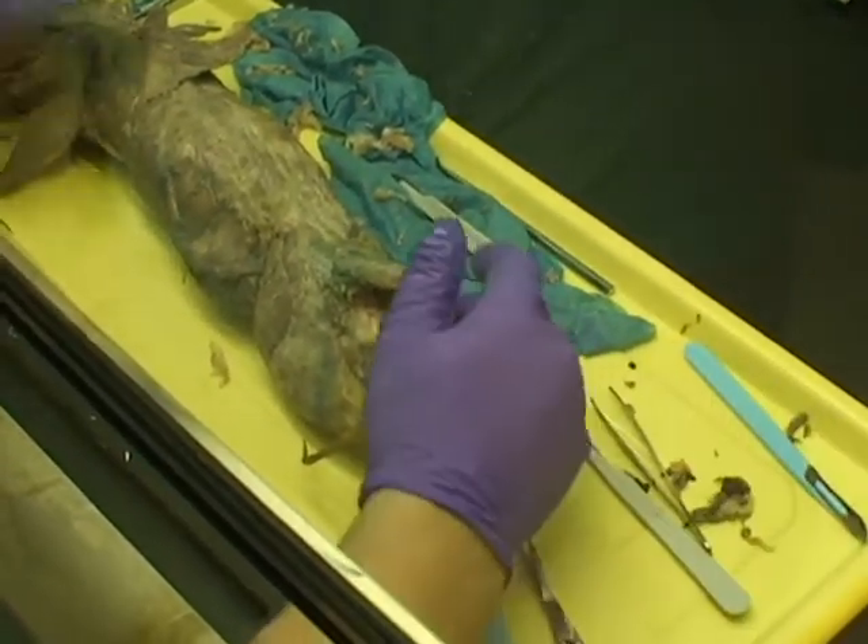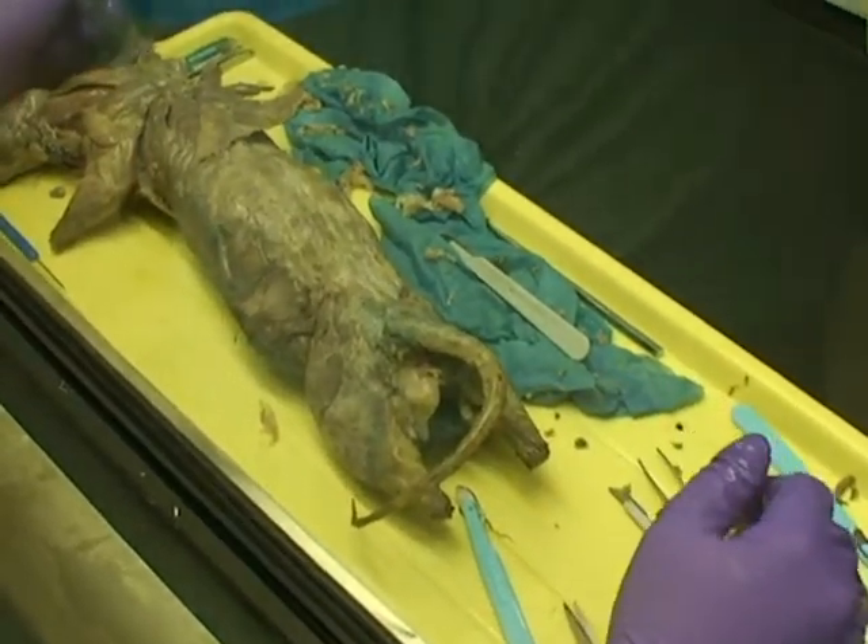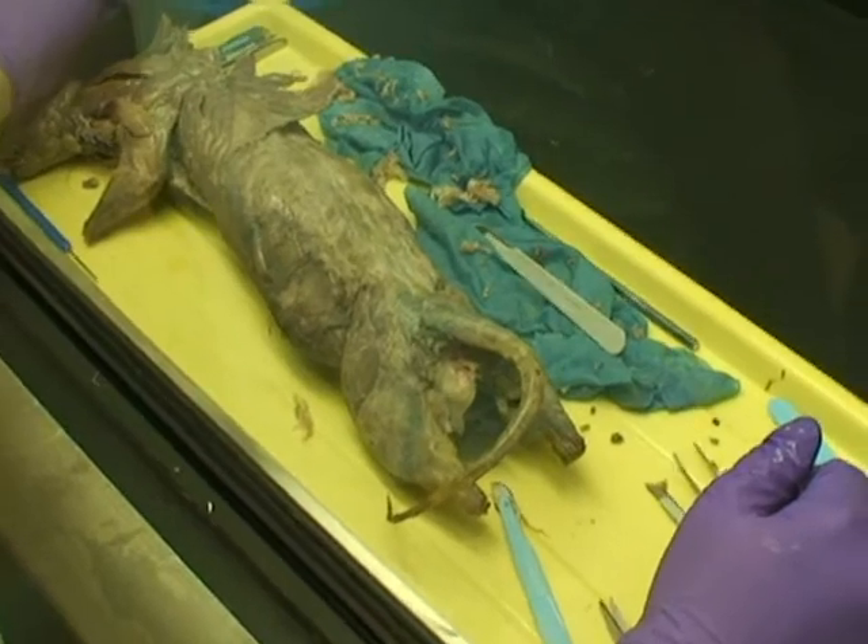Do they have to rinse it out with water or anything? No, just wipe it down. If you just wipe it off, the smell shouldn't be too bad — unless they think it smells awful. Thanks, Ben. It smells awful.